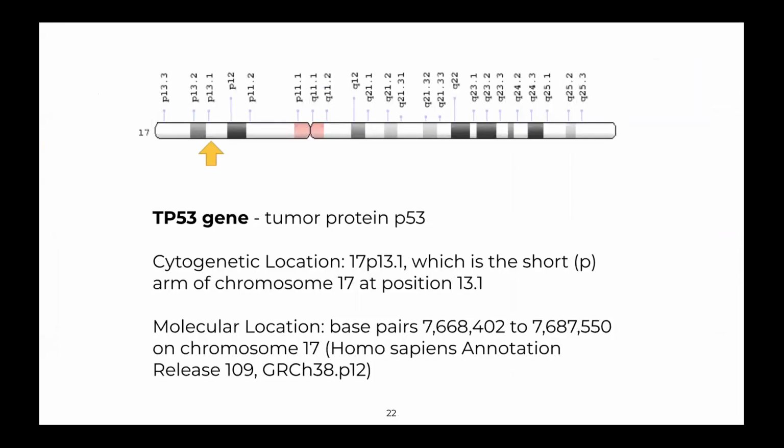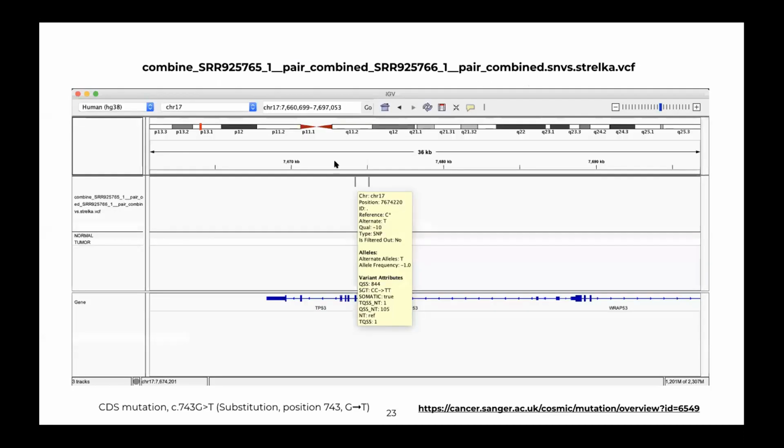And one of the things that we talked about is the P53 gene, the gene in chromosome 11, I think, is supposed to be where, or chromosome 17, yes, sorry, that we can now interpret, right, being an important gene in the tumor or in the cancer when we are trying to analyze for cancer mutations. So this is an example of how we can visualize the VCF file, and here you can see the P53 gene.